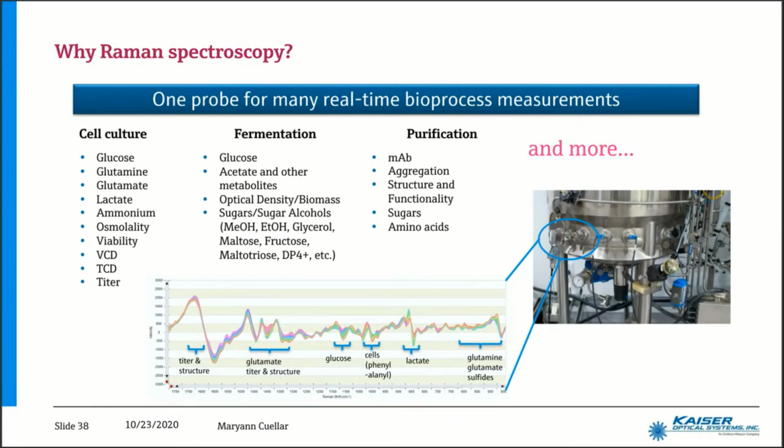So why is Raman spectroscopy so popular in biopharma? Well, Raman probes can be inserted directly into bioreactors, fermenters, or flow paths to measure multiple process and quality parameters with a single inline probe. This is a list of the average Raman measured parameters found in publications, but the list is not all-inclusive, and not all of these components can always be measured. Detection and quantification levels are subjective to the specific process or type of samples. Other things that can affect Raman's quantification capabilities are how quickly you need a result, if your Raman system and probe is suitable for your application, and the accuracy of the reference samples used to train Raman models. But if we narrow down to one proven application and trusted Raman equipment that's suited for that application, these unknowns become much easier to address.